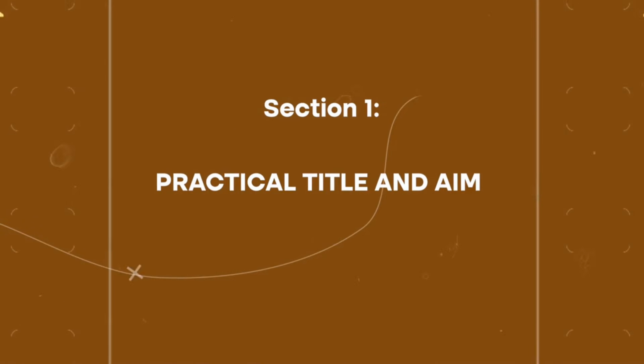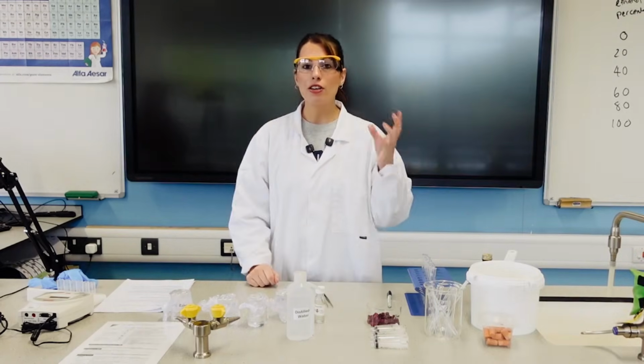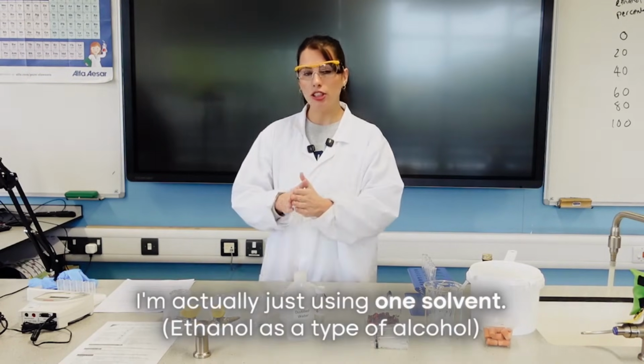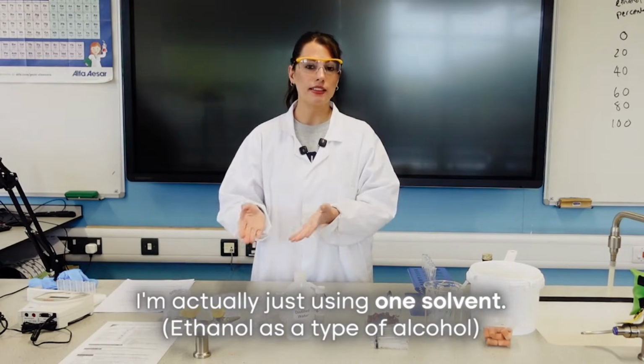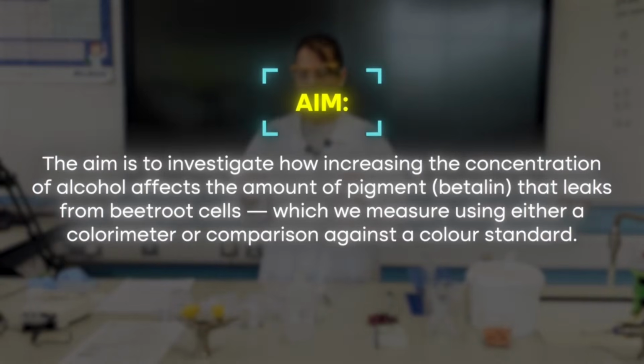So the aim of this experiment is looking at the cell membrane, that phospholipid bilayer. And you could look at the effects of different temperatures, different solvents. I'm actually just using one solvent, ethanol as a type of alcohol, and varying the concentration. And we're going to be investigating how the different concentrations of ethanol affect the permeability of the membrane, that cell surface membrane of the beetroot.